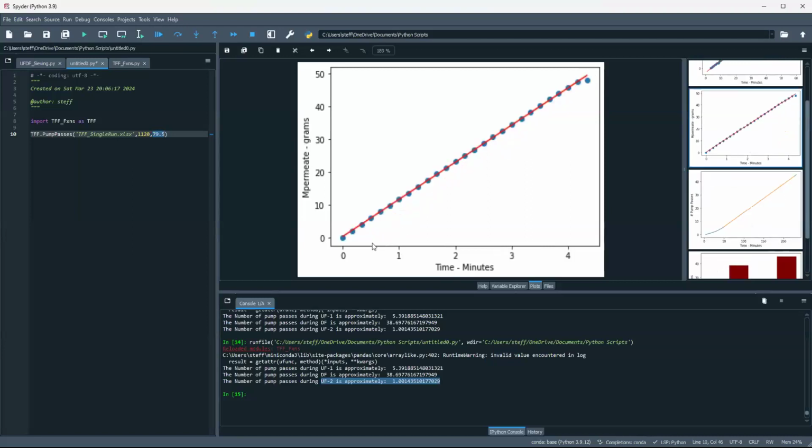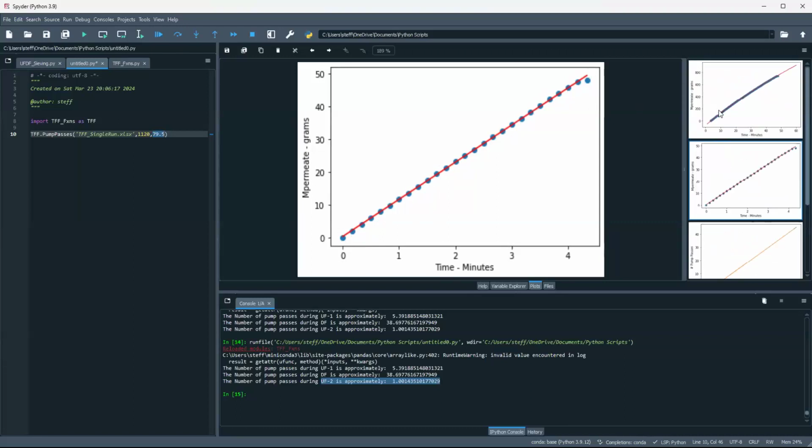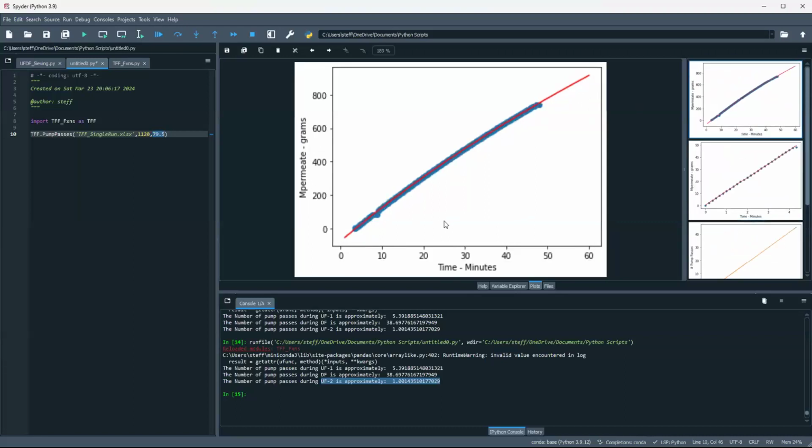These are the curves that I fit, where this is technically the log that I was talking about. I should probably have a title on this, but this is for the second concentration step. You can see that it's really short and it stays pretty flat, and it really just looks like a straight line. However, for the first concentration, you can start to see it taper off a little bit here.